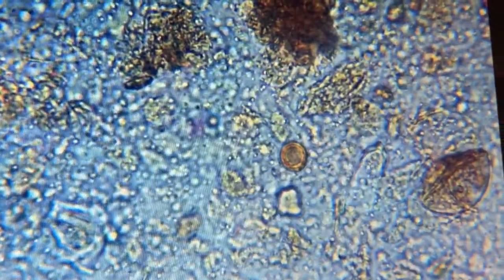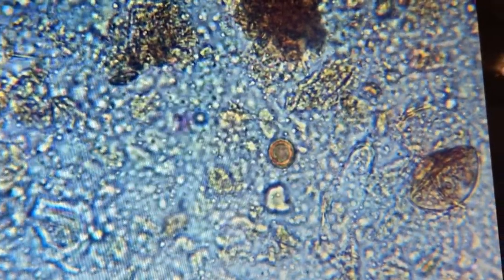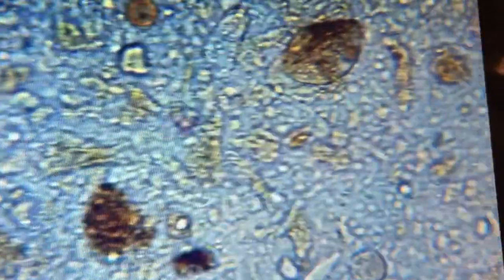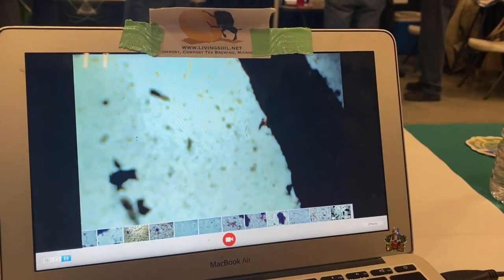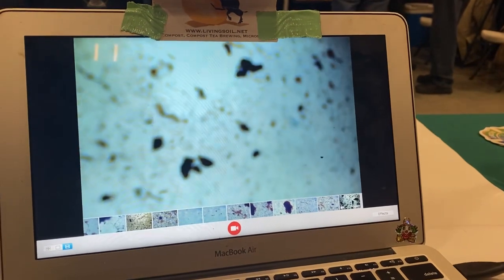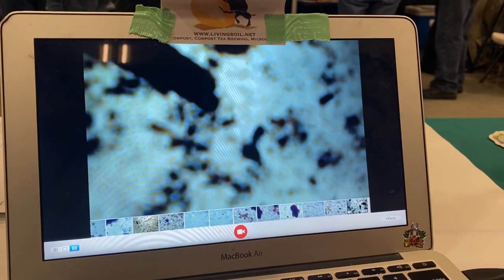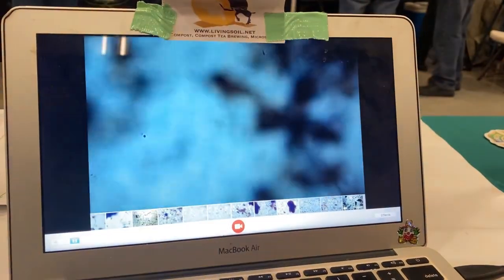For two years, this material isn't as decomposed as Zach would expect. Decomposition slowed way down at some point — maybe when it went anaerobic — and it's never really recovered. There's a big amoeba right there. Then: this compost that's only four months old actually has more fungus in it than those other ones that were 10 months old — hands down.